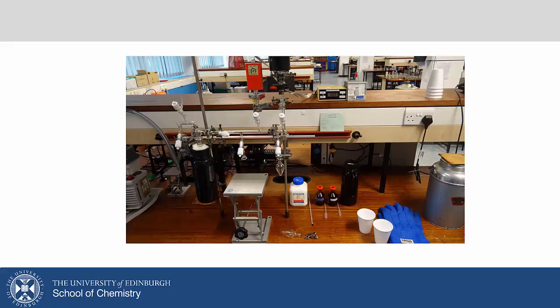It's a very simple, elegant experiment, and it's a great one for teaching how to use the vacuum line. Detailed instructions on using the vacuum line are in the Technique pre-lab video linked in the electronic lab manual.